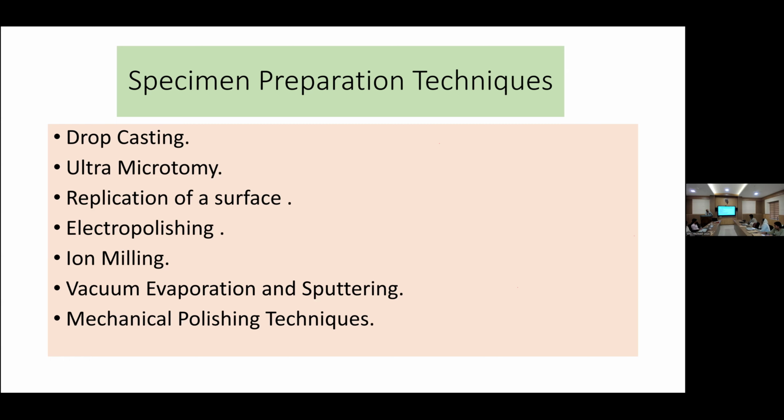The only criterion is that the sample should be conductive. If the sample is not conducting, then we should make it conductive by coating some gold particles or some carbon, to avoid the electron cloud formation, because of which we will get some blur and damage.